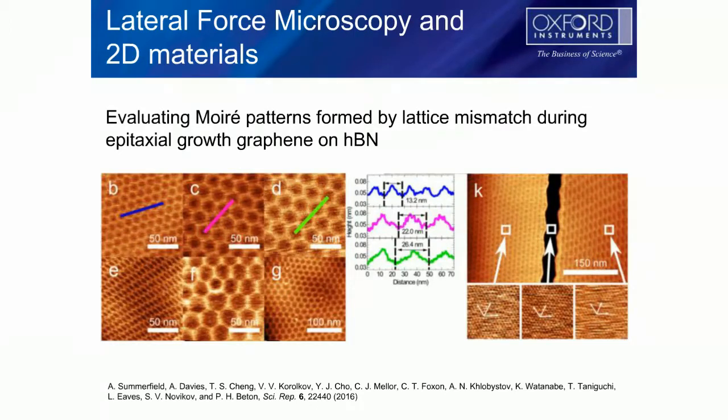And what they attribute that to is either a minimization of the energy of the strain from the lattice mismatch, or a region where two of these things grew together but didn't merge. So this was a really interesting paper using simple topography, right? And coming up with some really nice conclusions on a novel way of making these 2D materials.